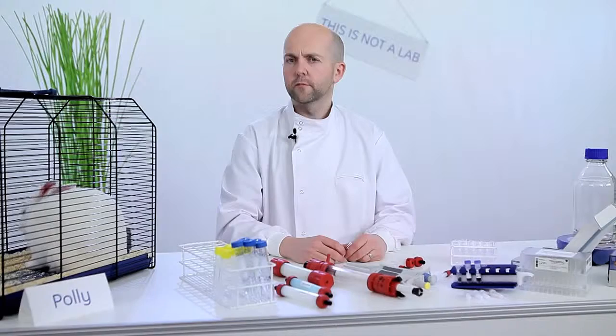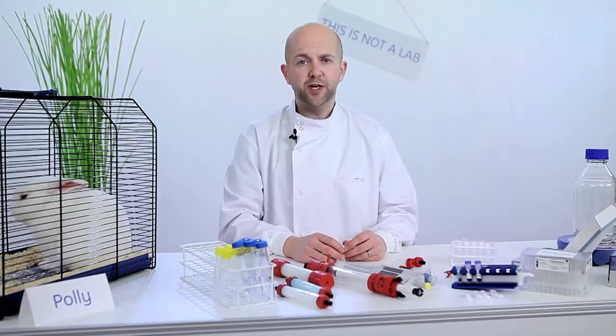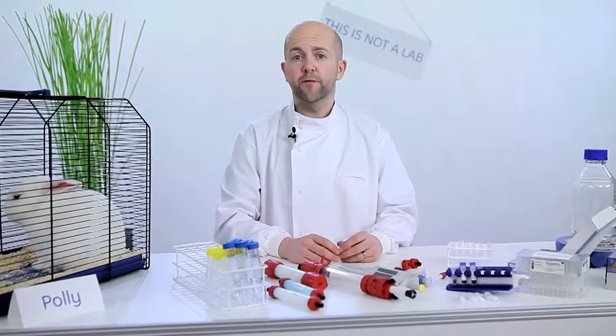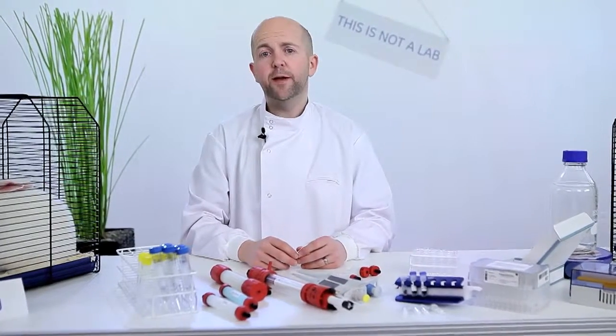Tip number 3. Protect acid-labile antibodies with tris buffer. It is important to remember that although protein A and G bind antibodies with a strong affinity at neutral pH, they can bind over a wide pH range. In order to elute the bound antibodies, a decrease in pH is required. This will vary depending on the species, and at low pH, acid-labile proteins may be at risk.